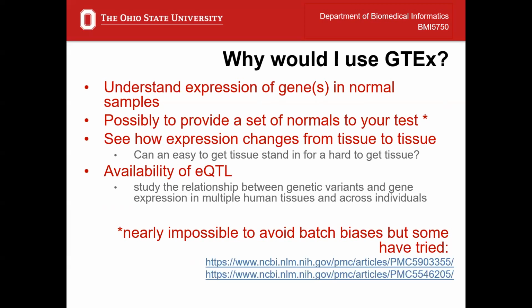If you're going to compare a biologically relevant tissue to something easier to capture, like blood or some sort of other specimen, you may want to use GTEx.